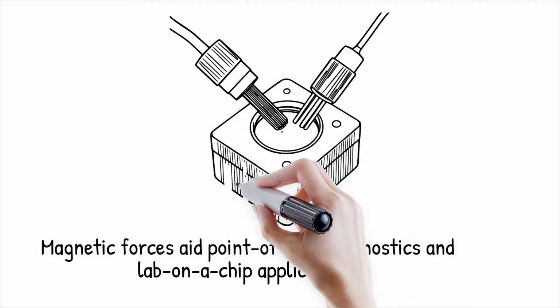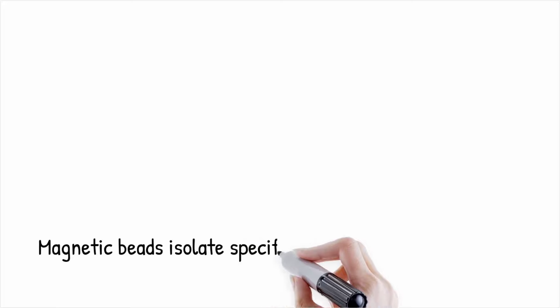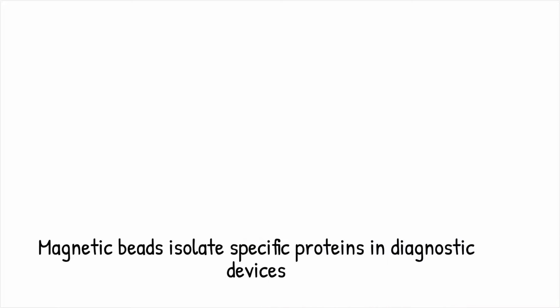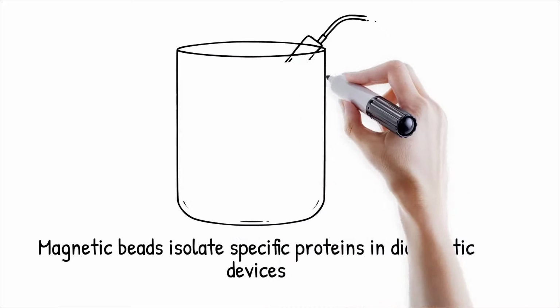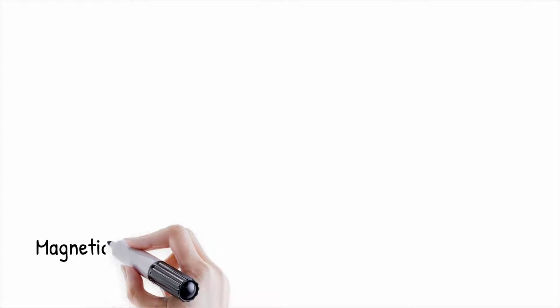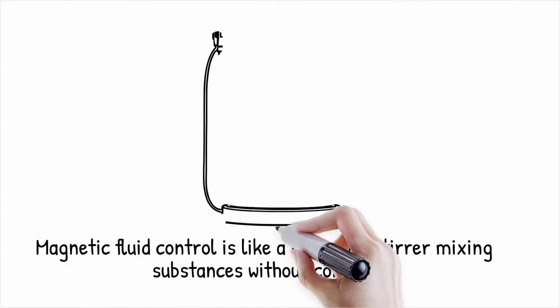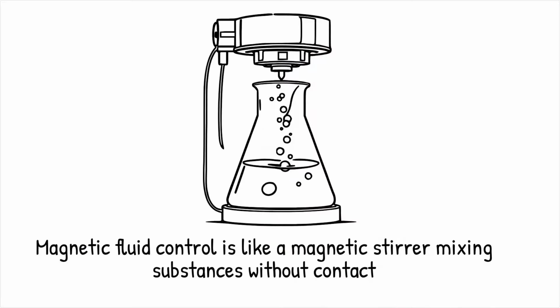Magnetic forces are particularly useful for point-of-care diagnostics and lab-on-a-chip applications involving biomolecule sorting and pathogen detection. Magnetic beads, functionalized with antibodies, can be used to isolate specific proteins from blood samples in diagnostic devices. Magnetic fluid control is like a magnetic stirrer in a laboratory flask, mixing substances without direct mechanical contact.